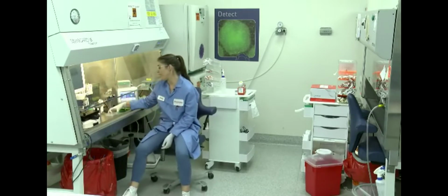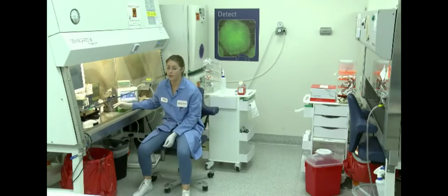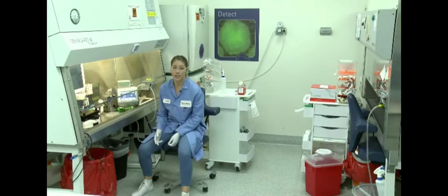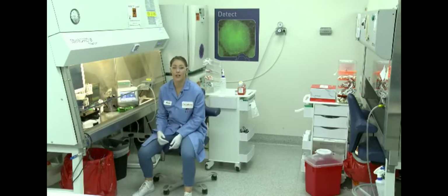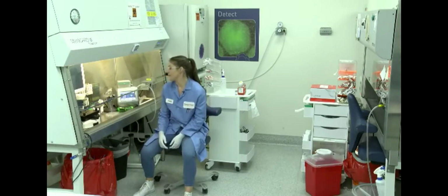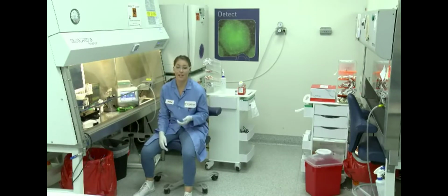I have pre-coated a 24-well plate with laminin 521. This is a feeder-free culture matrix that, when used in combination with our StemFlex media, will give you really good post-electroporation cell survival. StemFlex in general is really good for any application where your iPSCs are under stress, particularly if you're using single-cell passaging or doing reprogramming, or in our case, genome editing. To further enhance post-electroporation cell survival, I'm going to add RevitaCell into my media. RevitaCell is just ROCK inhibitor with additional antioxidants, and this is really good to use whenever you're singularizing your iPSCs.